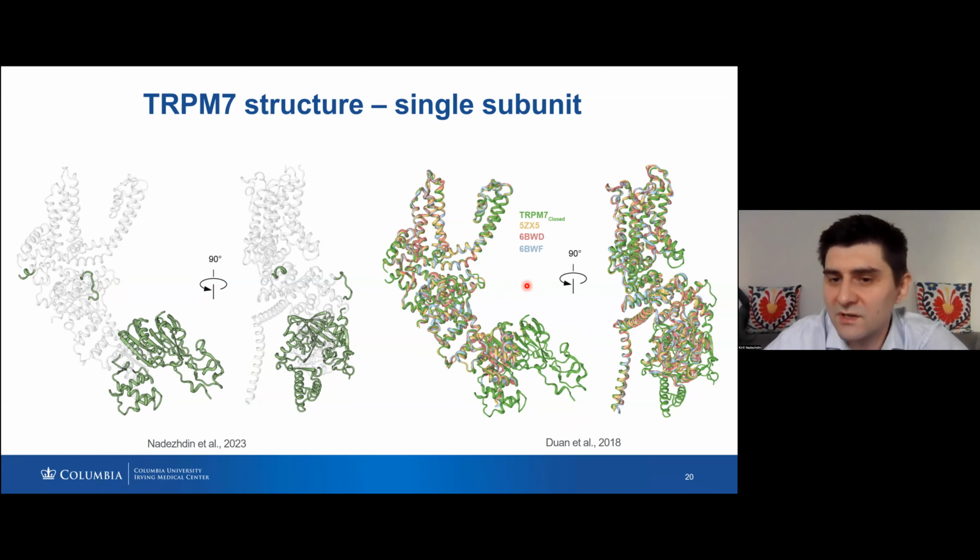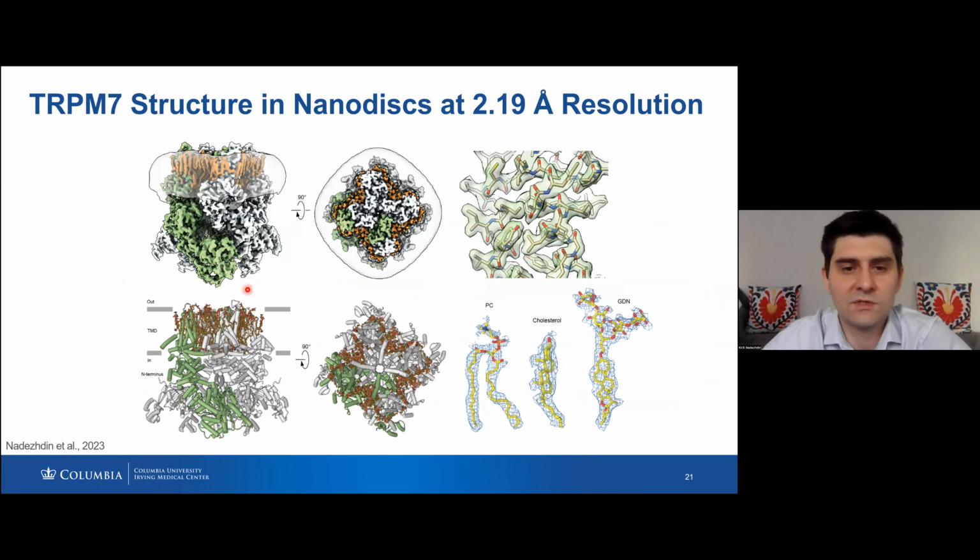And one more interesting thing is that although they tried different conditions, adding different minerals and different compounds to make the samples, they ended up with 3 structures. They look absolutely the same to me, and they also look absolutely the same as the conformation that we got. So this is the observation of how it looks.